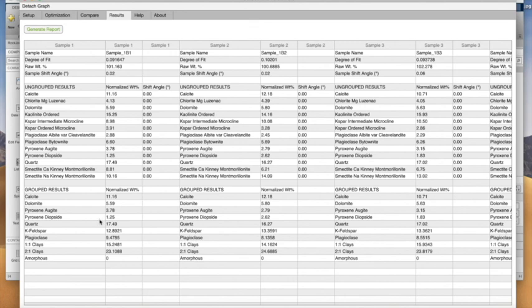And remember, I told you those two minerals are part of a solid solution series. So whatever diopside sample is in the mixture, it might actually be in composition something in between the augite and diopside samples that happen to be in the RockJock database.